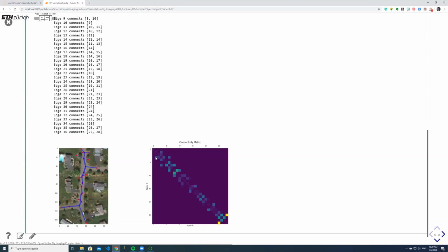And then I would guess it's probably one up here, because it's a pretty complex one, and these are connecting with very long nodes. That gives us the yellow color, so I would guess it's around here in this area. And so on. So with this matrix, the more connected this skeleton is, the more you fill out the connection matrix.